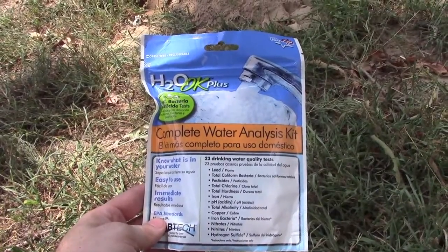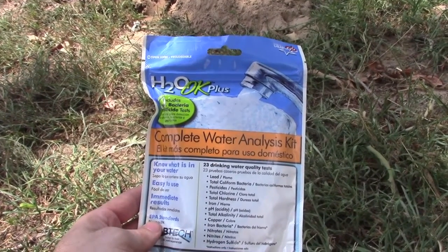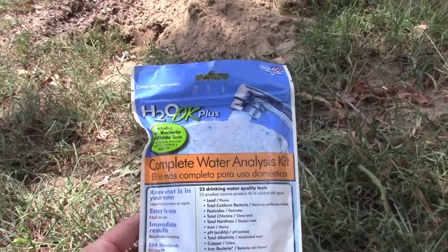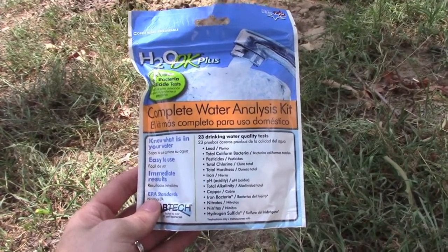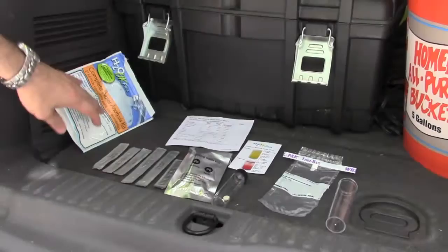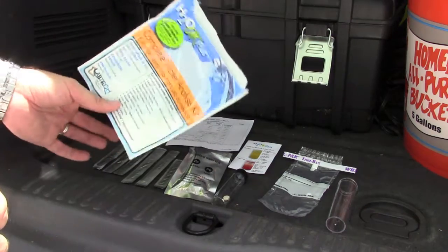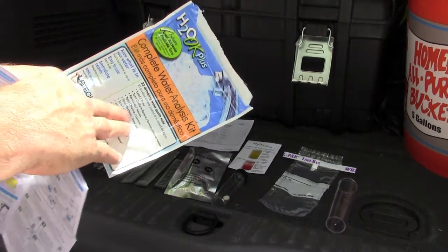I'm going to do a water test for the well today. This kit was recommended by a friend of mine who detected coliform in his well after he moved in and got sick. It's the H2O OK Plus. You can see it tests for a lot of different things. The kit was about $28 at Home Depot — I didn't find the one I needed at Lowe's, which only has about half these tests.